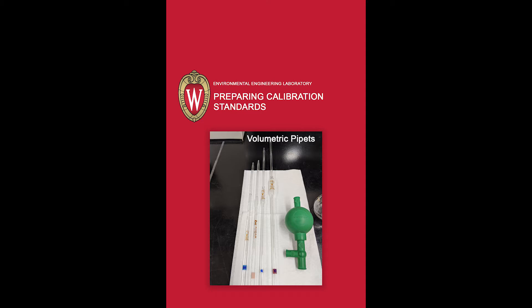This video will describe two ways to prepare a set of calibration standards. Here are the supplies that are required.